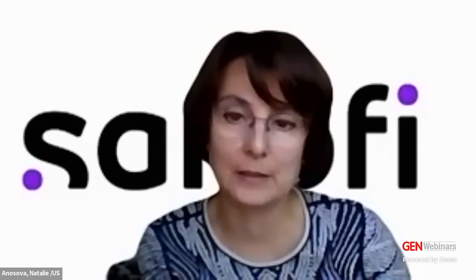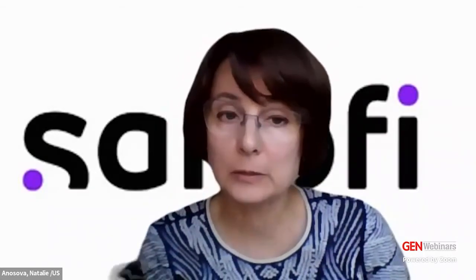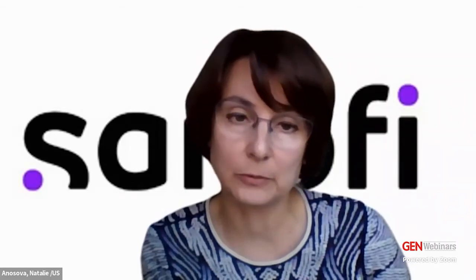Natalie, we have a question for you. An audience member would like to know, why did you choose RVPs for your preclinical work? Did you observe similar results using pseudovirus and live virus if you compared them? Thank you, Jeff, for the question. I highlighted this a little bit in my talk. I can expand a little bit further. Yes, we had this discussion early on, which assay to choose, and we decided to go with the pseudoneutralization assay for multiple reasons. One of them is really simplicity. It's a BSL-2 reagent. No need for a BSL-3 lab, which the live virus definitely would require.